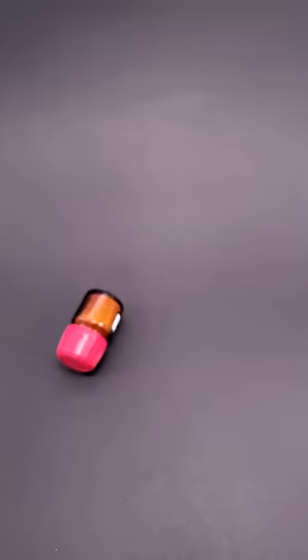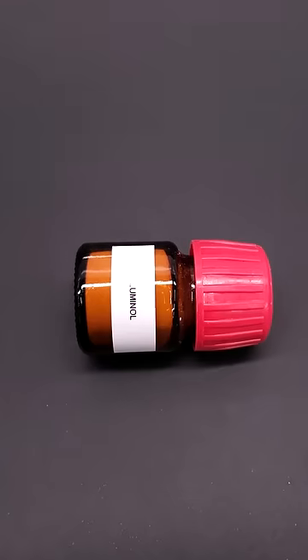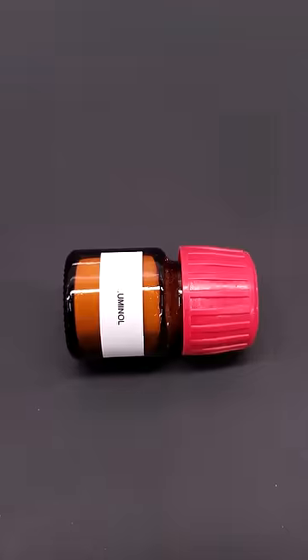This is luminol. It's a chemical that exhibits something called chemiluminescence, and when it reacts, it can release light.